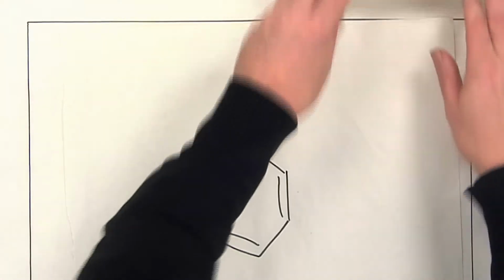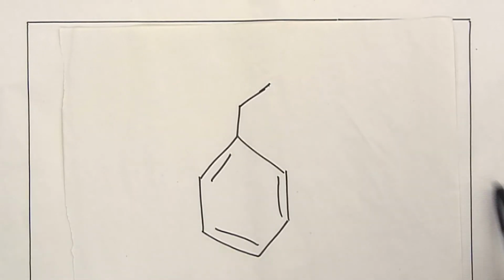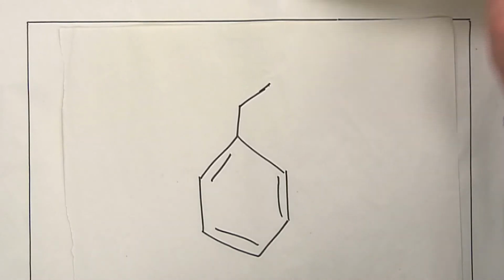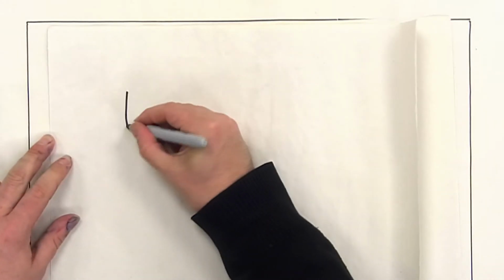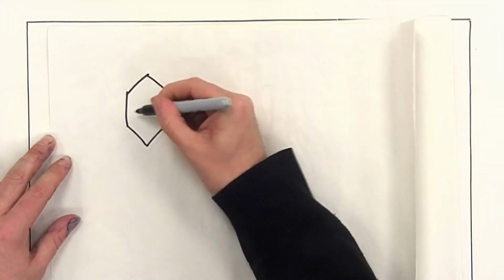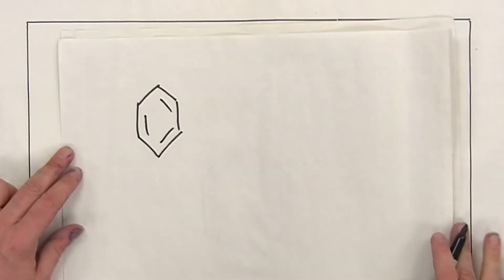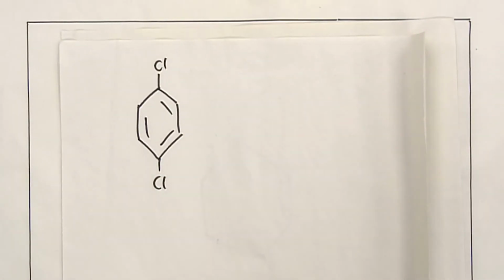Okay, so as Eleanor said, that's just to show you this is a so-called mono-substituted benzene because you've just got one group off the benzene ring. So let's just look at 2 di-substituted benzenes, partly because we'll need to look at these a bit later on in the labcast. And I'll start with a more symmetrical one. Let me just draw it out. So I'm going to have 2 chlorines, one at the top and one at the bottom. Okay, so that's fairly symmetrical.